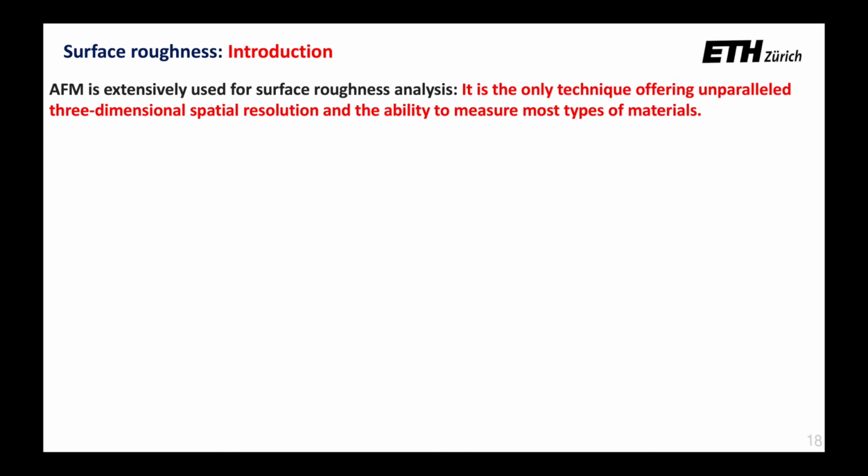So roughness plays an important role when two surfaces come into contact. Roughness is often a good predictor of the performance of many mechanical components.